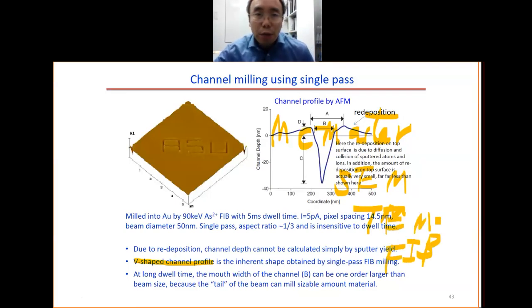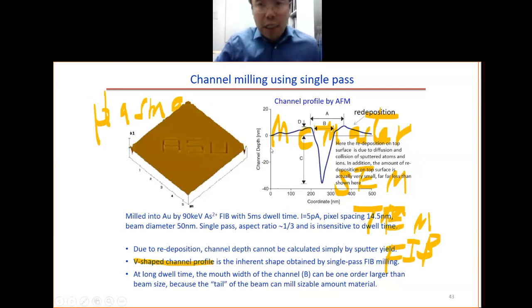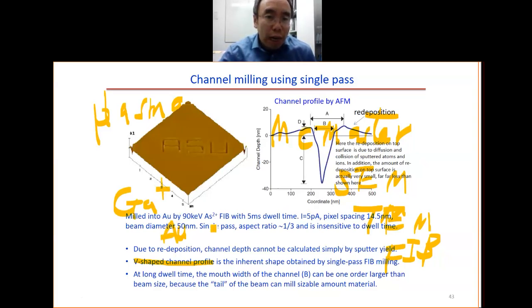For example, we talk about plasma source FIB. I think McMaster University is the only university in Canada that has the plasma source FIB that gives you much faster milling rate. At the University of Waterloo here, we have gallium ion FIB, and also we have the gold ion and the silicon ion. The gold and silicon ion, as we know before, is one machine. You use a gold silicon alloy to generate silicon ion and gold ion.